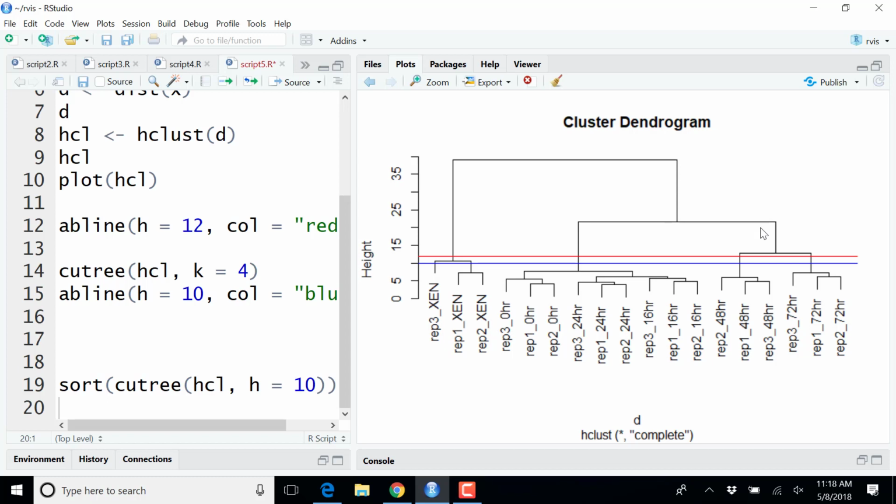And the clusters are not necessarily what you would like by looking at the plot, because when we look at the plot, we are not kind of linear. Right? We say, oh, I would like to have this plot, that plot, and so on. So it's statistics by eye, my favorite. Yes, it is. But coming back to these heights here, they are very small, so you can't rely on them. So the idea is to get a big overview and make sure that the overall pattern matches your expectations, or not.